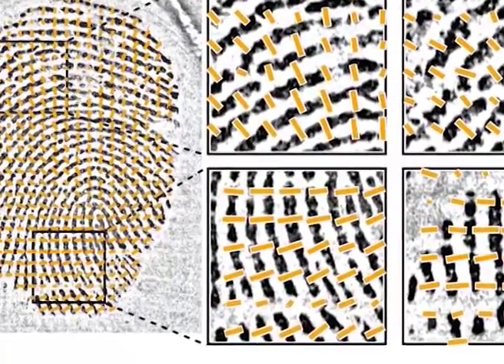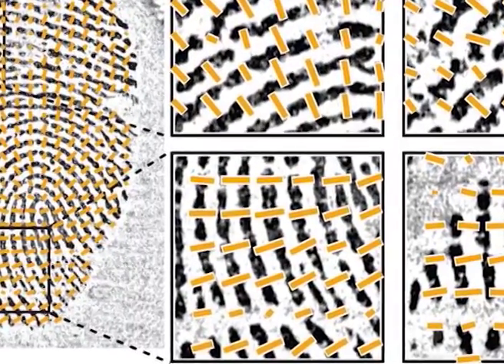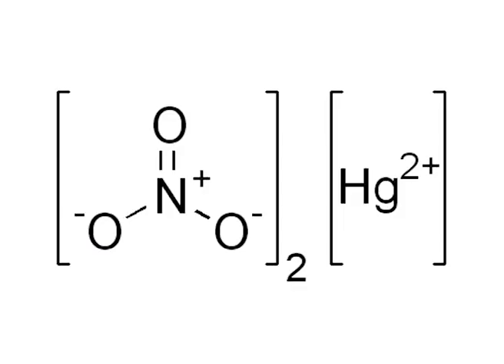To avoid this problem, it is recommended that as part of post-development procedure, the item should be first washed with water and then the area outside the periphery of the fingerprint be treated with a stopping solution. The latter delays the darkening of the background. The most commonly used stopping solution is mercuric nitrate, 3% weight by volume in distilled water.